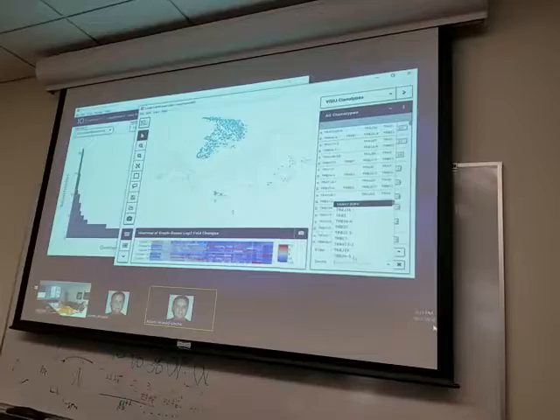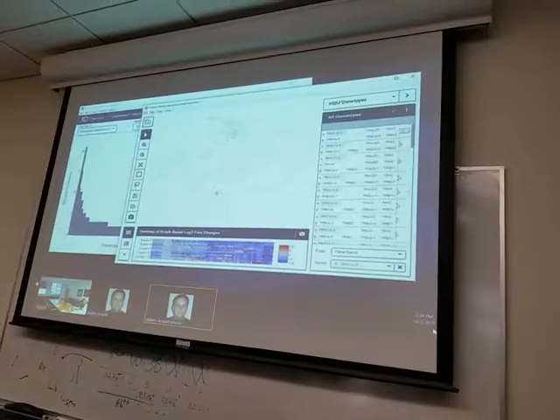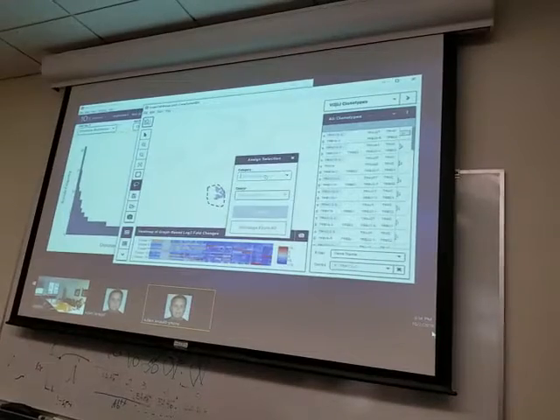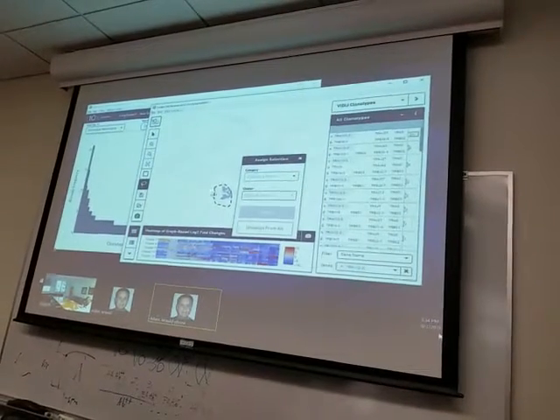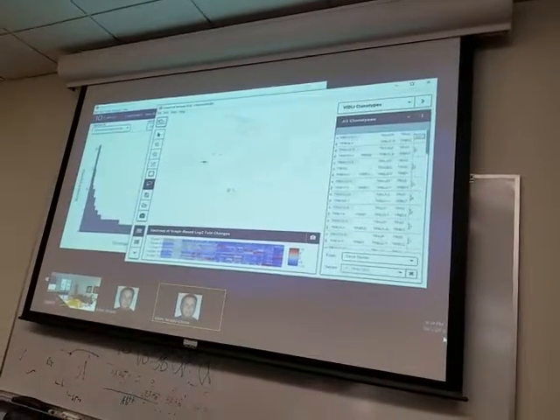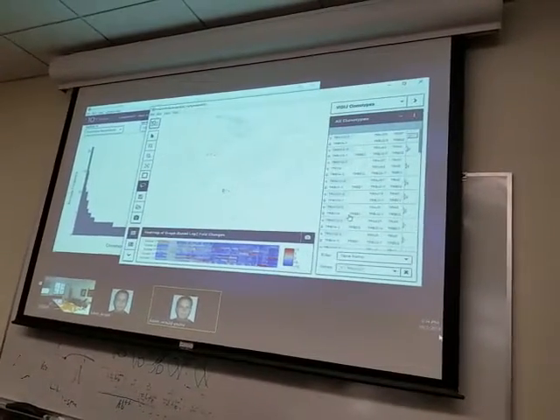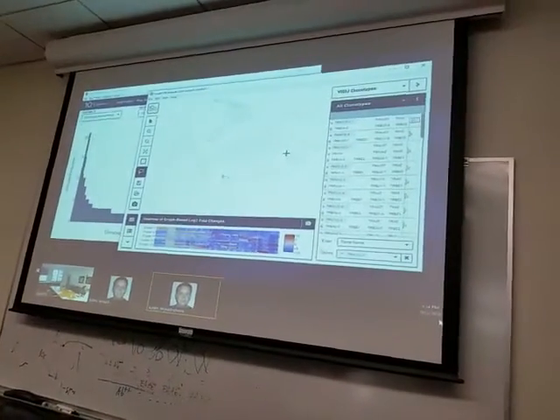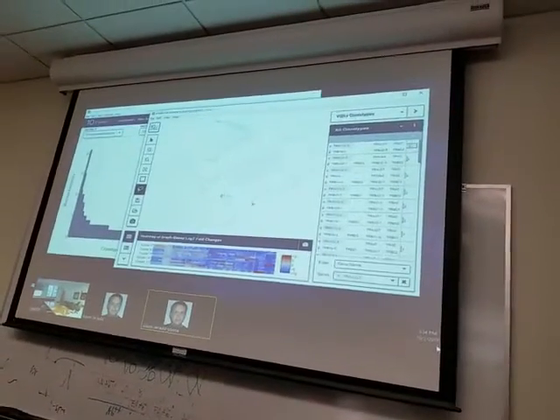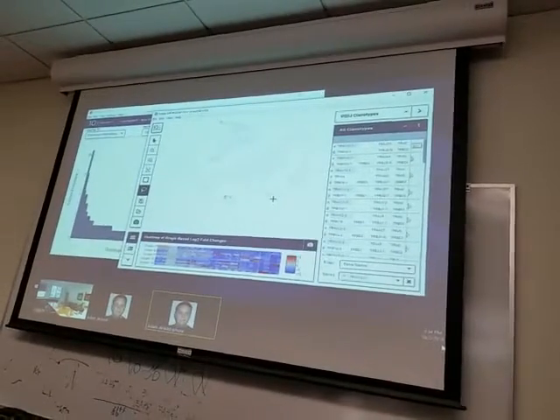What we can do is filter based off of annotation. If you have a particular annotation that you want to look for, you can filter and light up only those and see that they're predominantly in this population, and you can start to look for barcodes that you want to dig into further, like we did earlier when we were toying around with that IL-4. You could also export the genes like we did before. If you go to split view, you'll see the T cell receptor positive ones pop out, and then you can pull those out. Can you try?